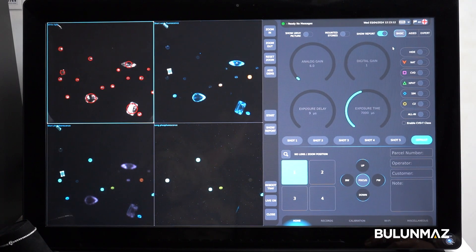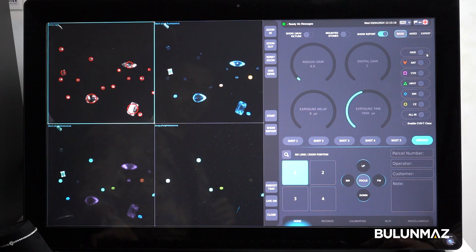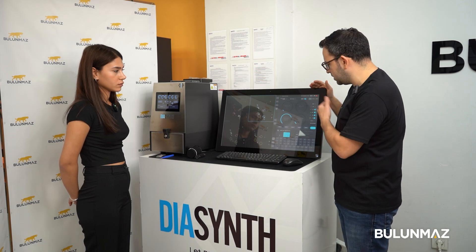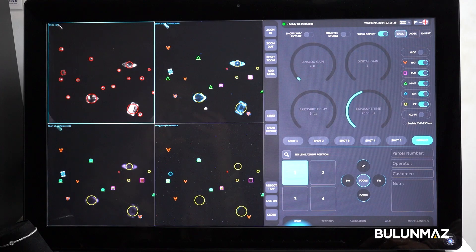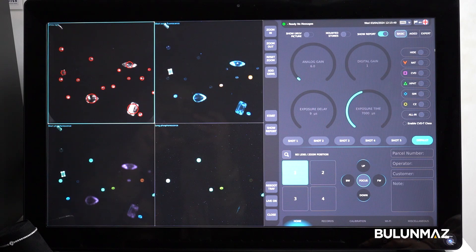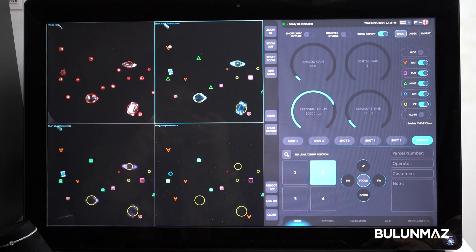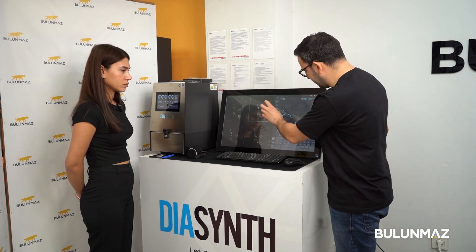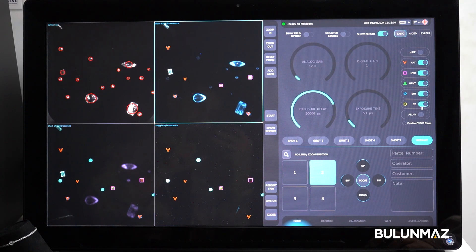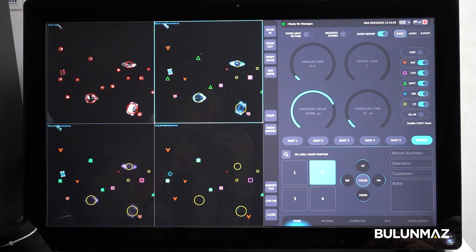Now let me show you how to study the machine results. When you look at the control screen you will see different colors and shapes — each means something. You can already see the legend. The orange triangle shows natural stones — we had four natural stones and you can see their positions. The purple square shows where the CVDs are. The green triangle shows HPHT stones — I can see three pieces. The blue square shows simulants, a group of non-precious stones. Finally, the yellow round shape shows the CZ stones — they appear bigger because the stones themselves are larger.